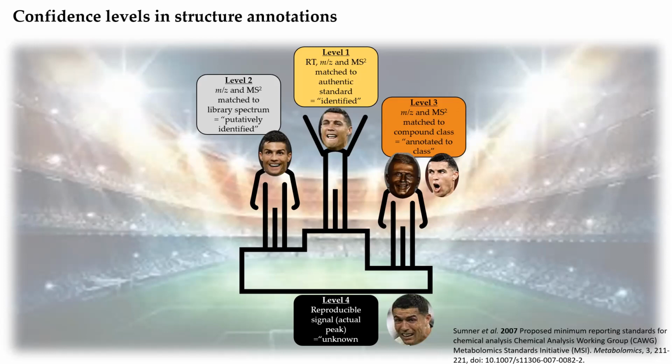Now, that being said, if you look at the data I just presented, we have level 2 annotations for a lot of the pesticides and the antiretrovirals, for example, but also we have the context of the antiretrovirals being present, or particularly present, in the urban impacted river, whereas the pesticides are enriched in the agriculturally impacted river. So we sort of have a context factor that would lead me to argue that maybe we're at like a level 2+ annotation or something like that with them.